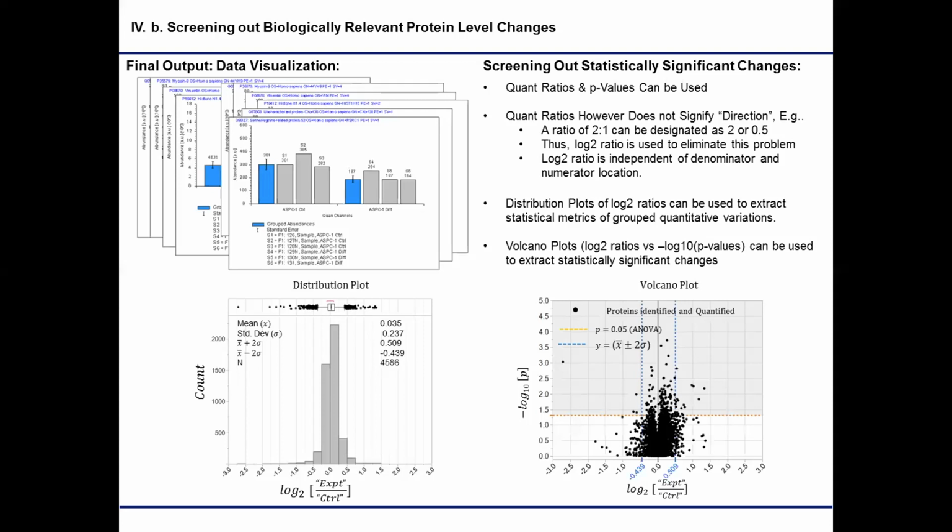If you have a change in a protein that regulates the DNA damage response, and you're expecting that as a consequence you're going to have changes in a number of different proteins at the expression level, then that is how you would form your hypothesis. Then you would do the experiment and see if that hypothesis is true or not, based on the justifications that you developed in your research project.